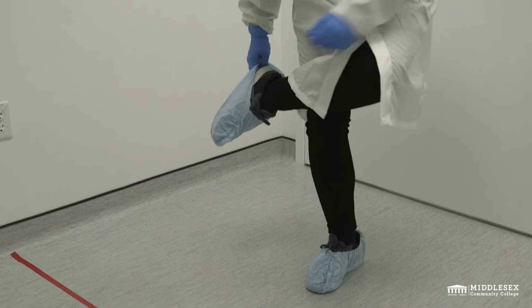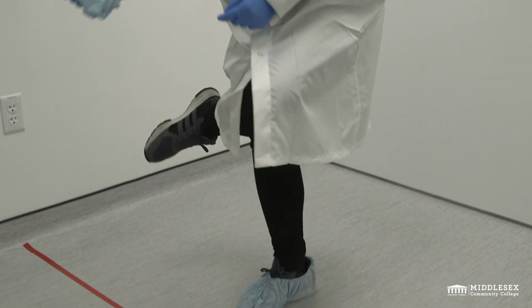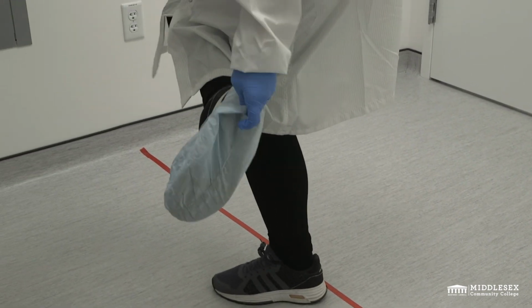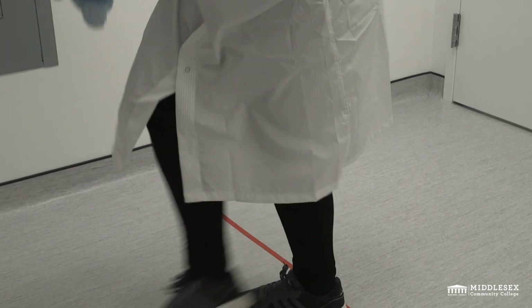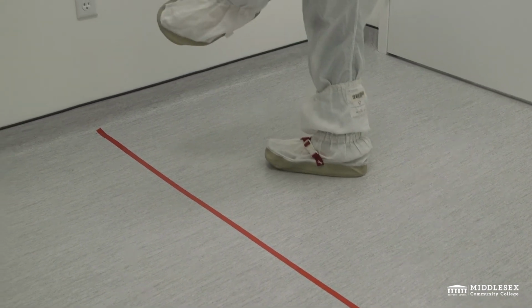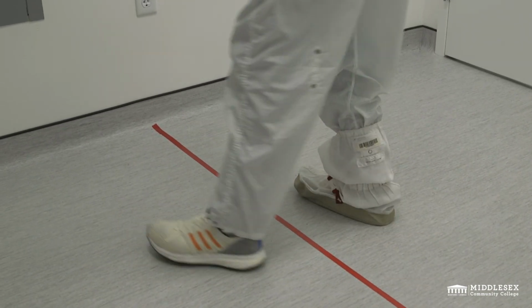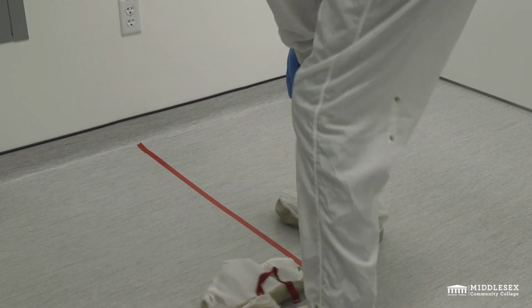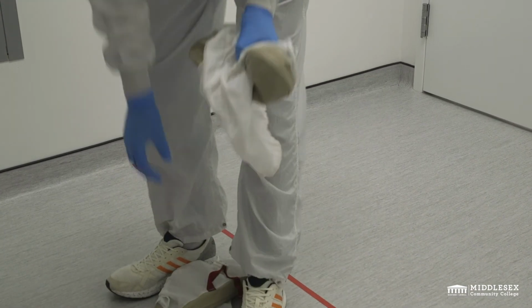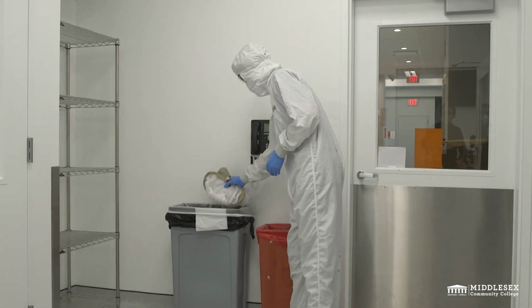Remove booties or shoe covers while crossing over the demarcation line. Place those items in the designated bin.